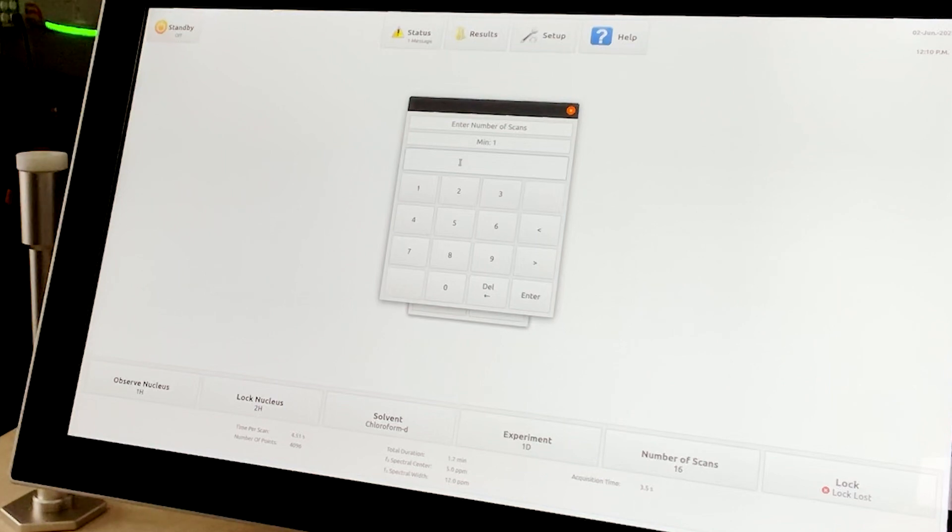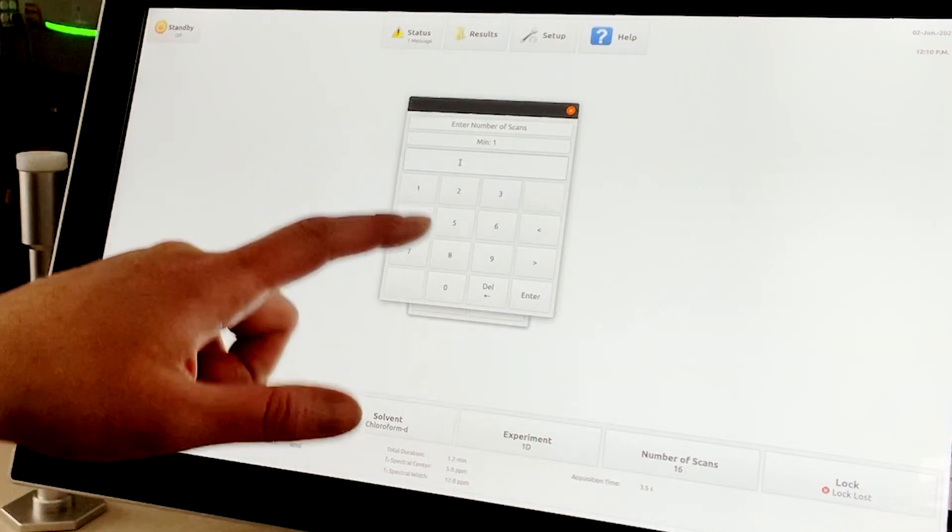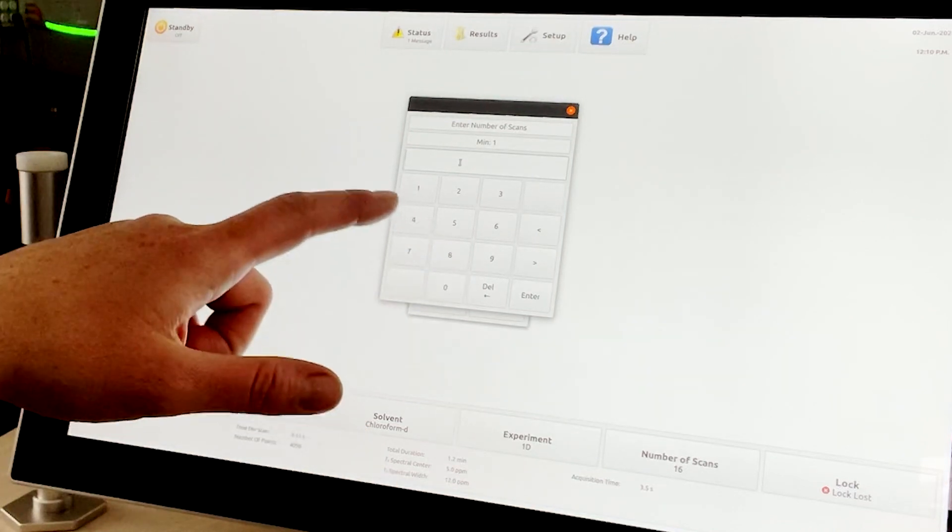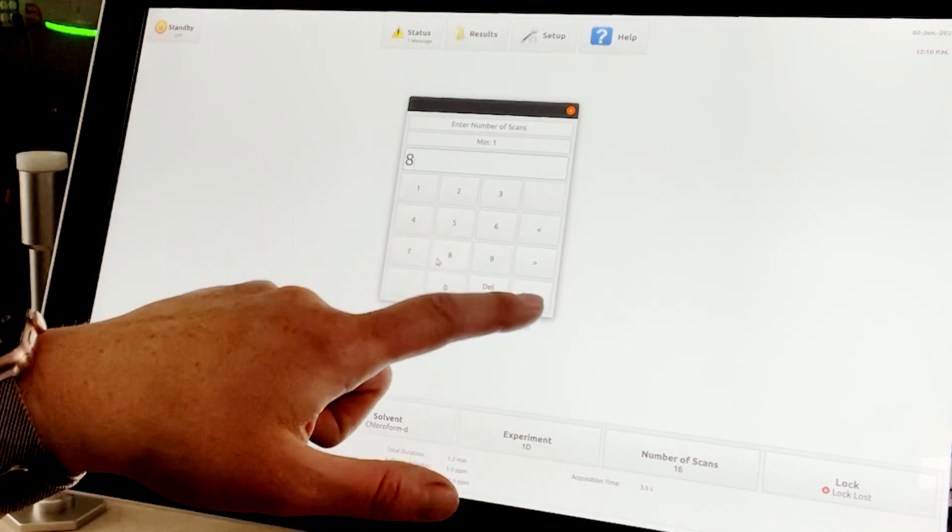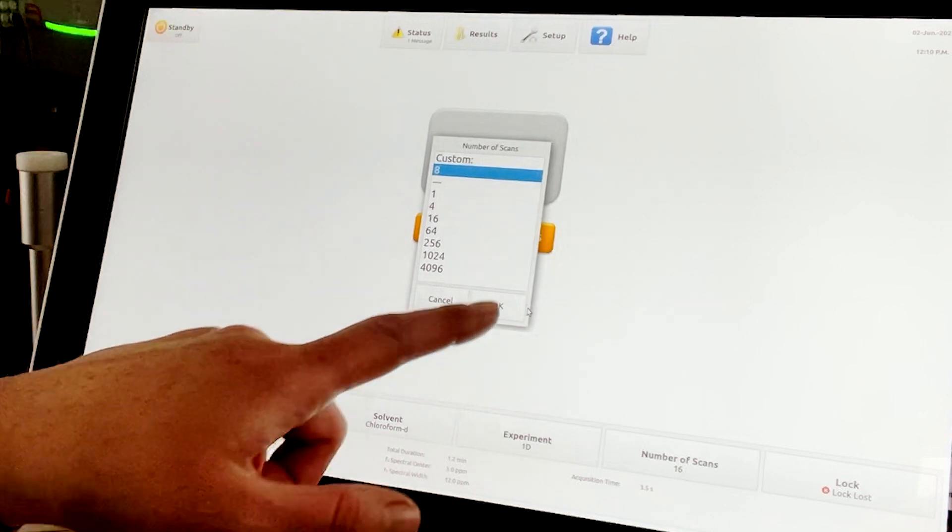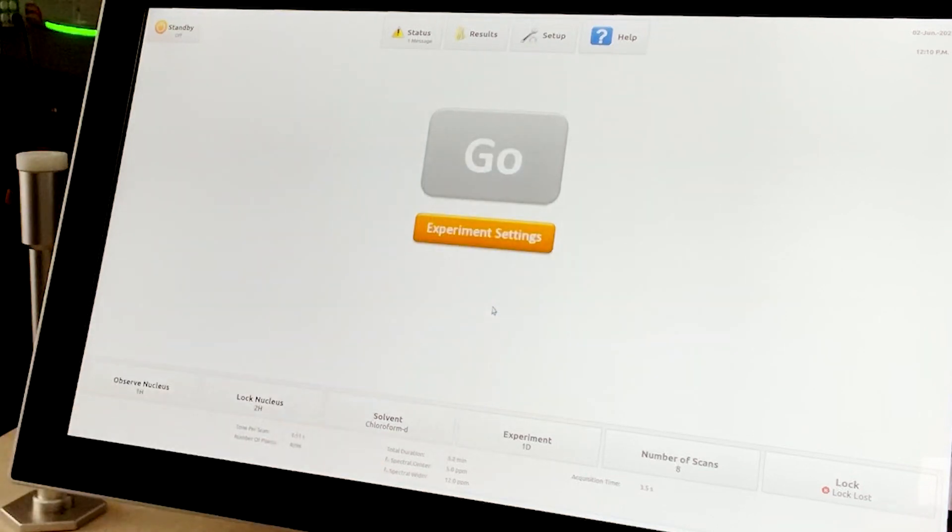The number of scans can be either selected from the pop-up menu, or a keyboard will appear, and the user can put in whatever custom value they desire. Prior to acquiring the data, the lock must be engaged.